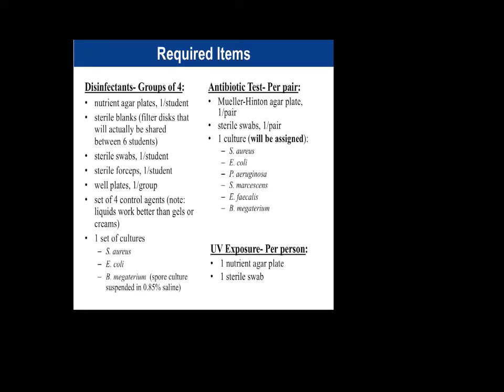For the disinfectants, we end up with nutrient agar plates, three plates each having its own culture on it. So we'll have Staph, E. coli, and Bacillus megaterium.